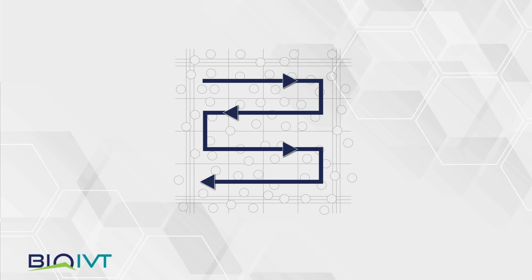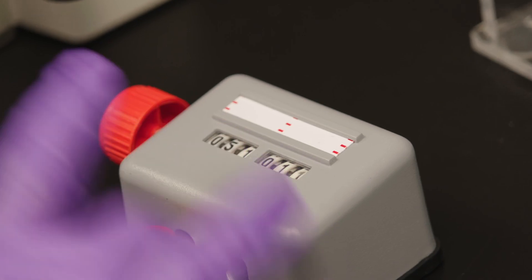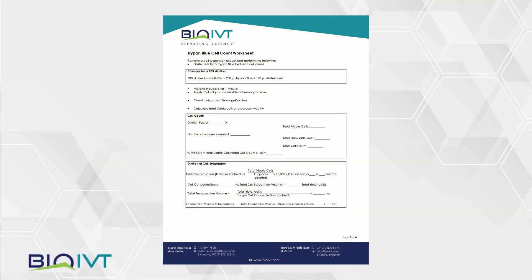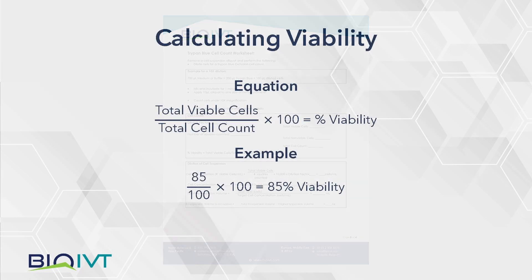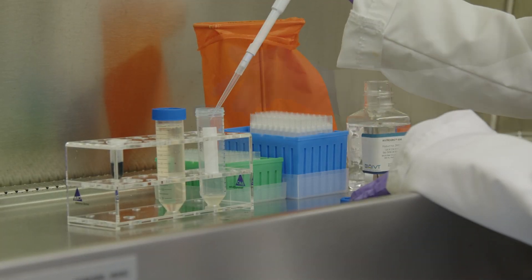Count both chambers — eight squares in all. Tally the viable and dead cells and sum them for a total count. Cell counting worksheets can be found in the resources section at bioivt.com. Divide the number of viable cells by the total number of cells, then multiply by 100 for percent viability.